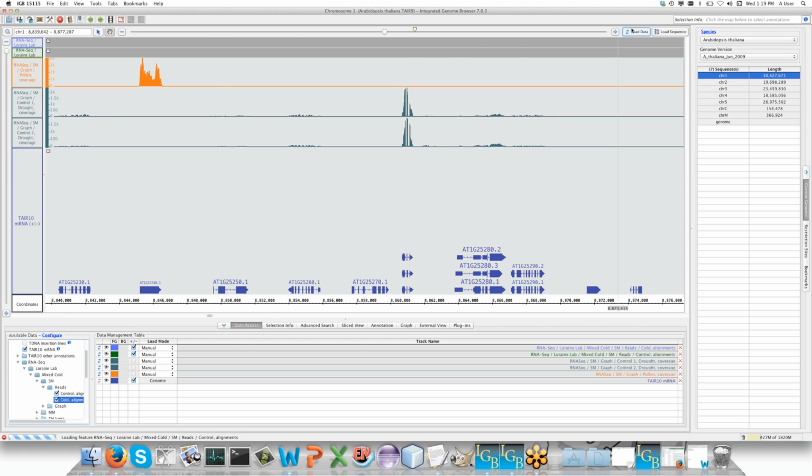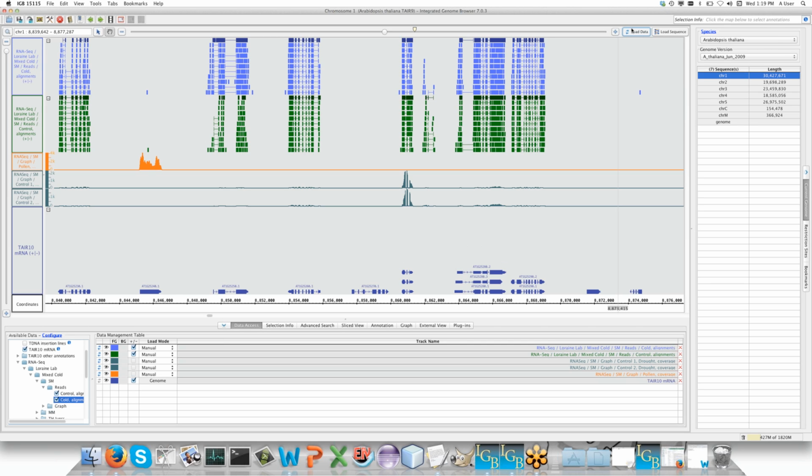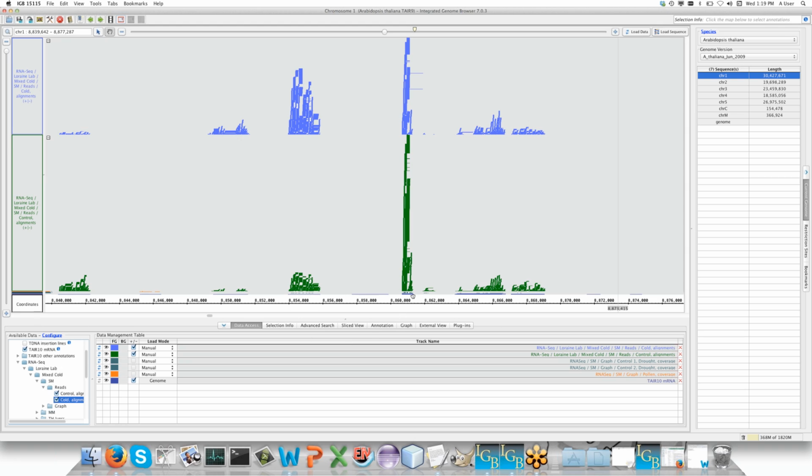With RNA-seq, you can have very, very large stacks of data. IGB initially limits it to 10 high and then a summary row. But if I use the Optimize button to give it permission to show me all of the reads, you can see that some genes have incredibly tall stacks and others very little, but no matter what, it forces the data out of the way. So we use these coverage graphs, which we call depth graphs, because it measures the depth, how many of these alignments are stacked at one genomic location, and renders it into a number.